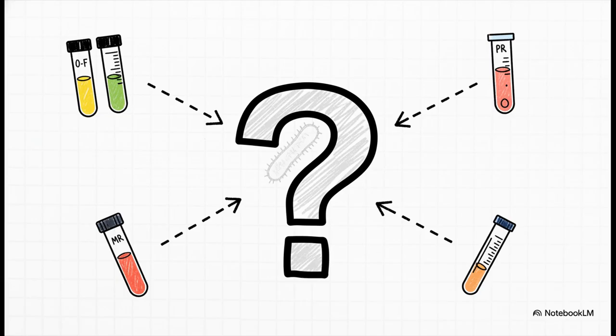It's not one single test that cracks the case, no way. It's the unique pattern of results across all these different tests that lets scientists build that definitive profile and tell one microscopic organism apart from thousands of others.